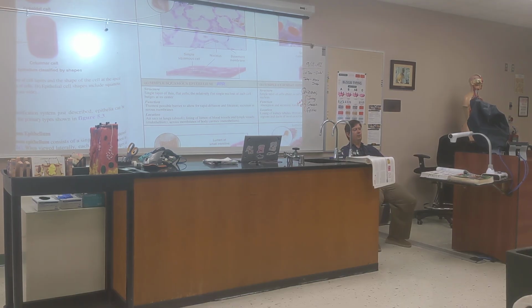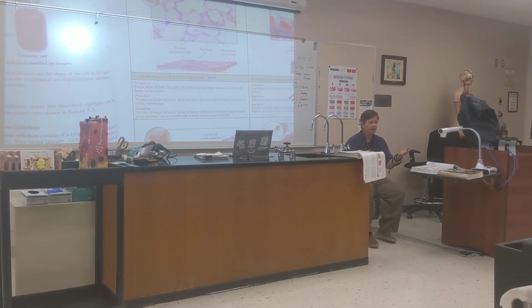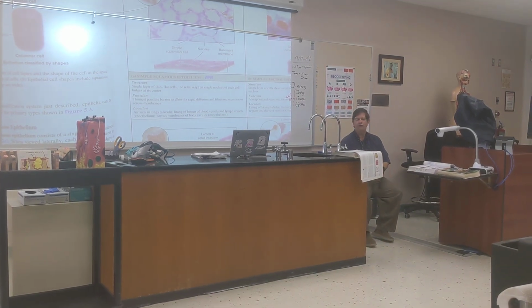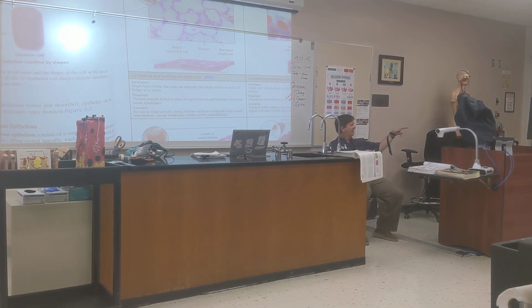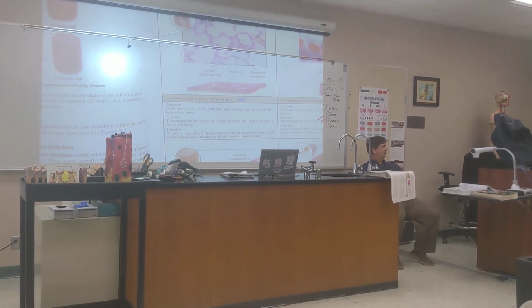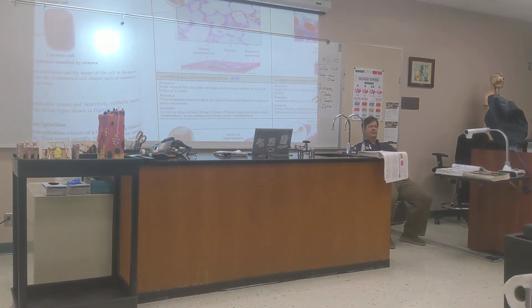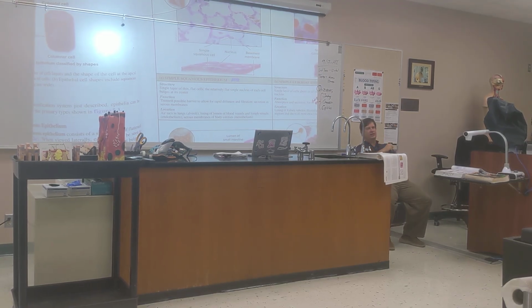What do you use if you want lots of protection? You want lots of layers. Am I right? Okay. So stratified squamous is the one we use for lots of protection, and that's number 4 on that table, the table 5.1 that we're talking about. Stratified squamous, this right here is stratified squamous, the lining on the inside of my cheek.